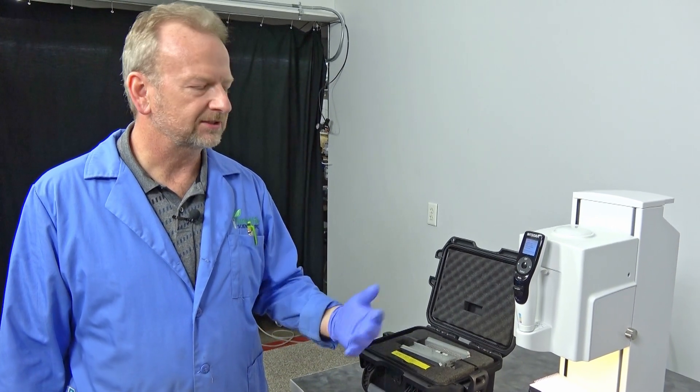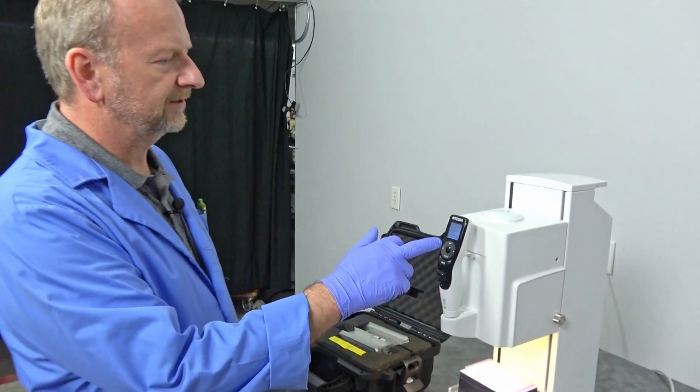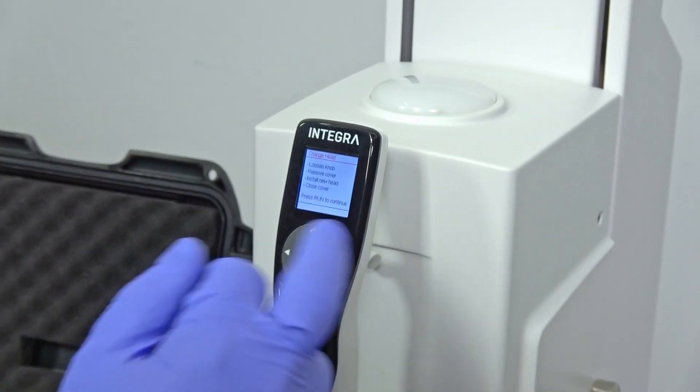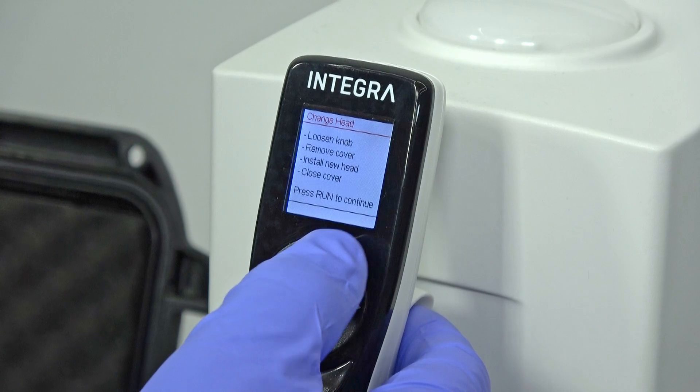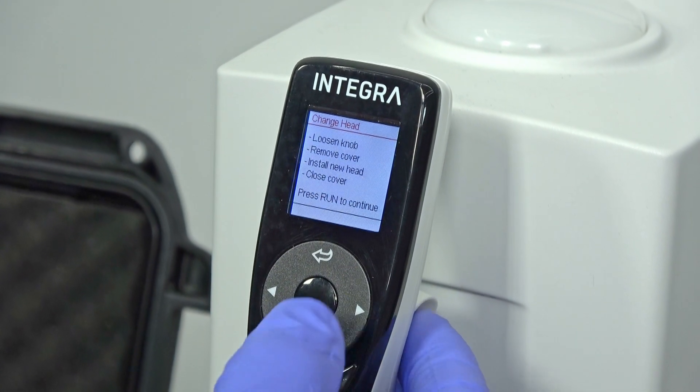So anyways, we're going to come over here to the control panel where it says change head. Actually, let me go back here real quick to the home screen and yeah, I'm gonna hit run.